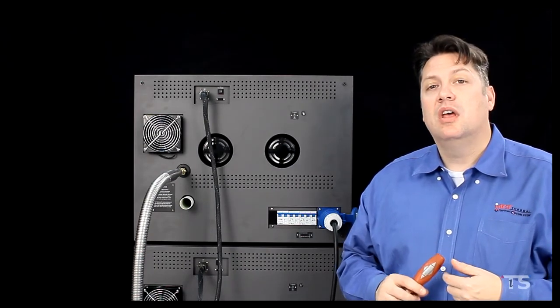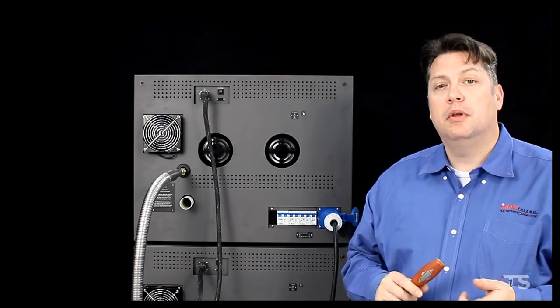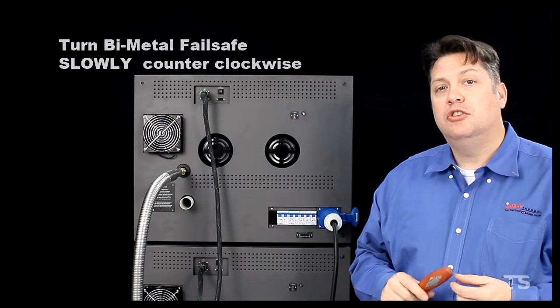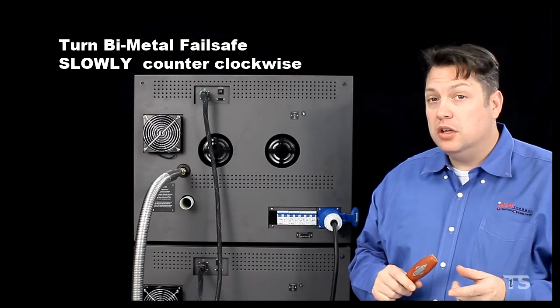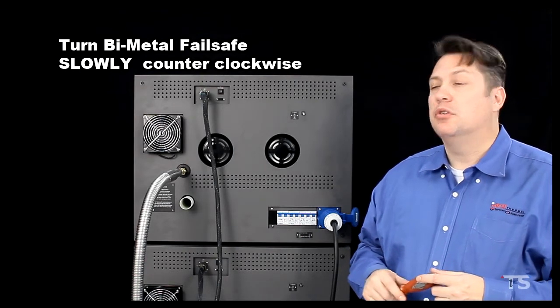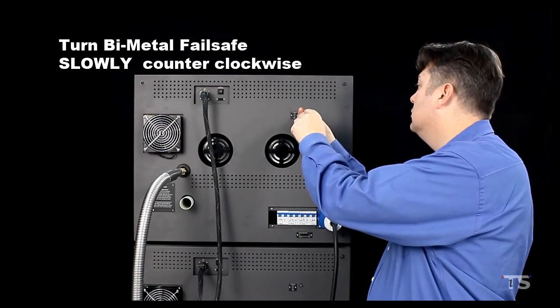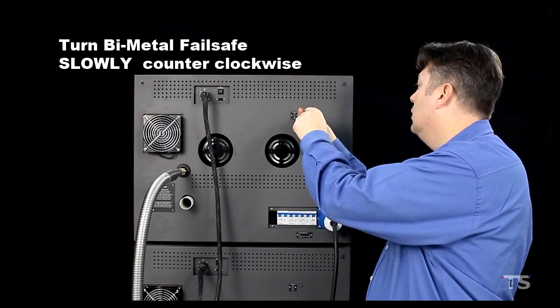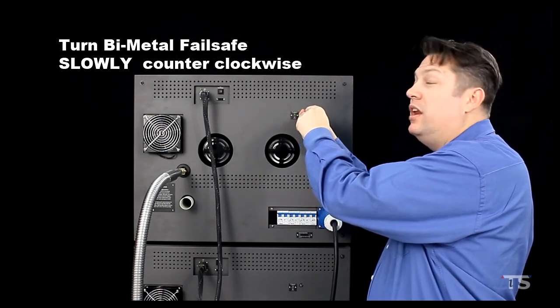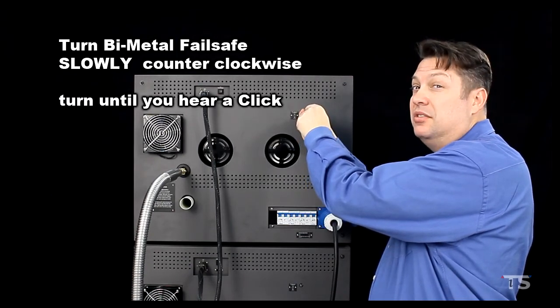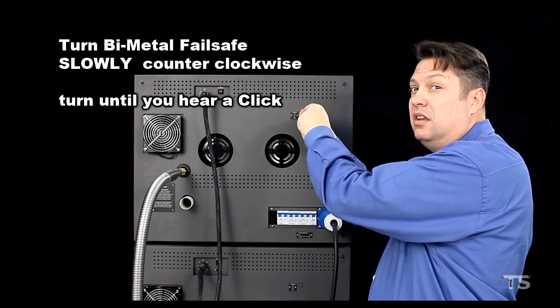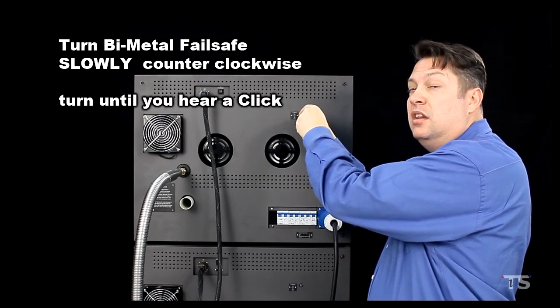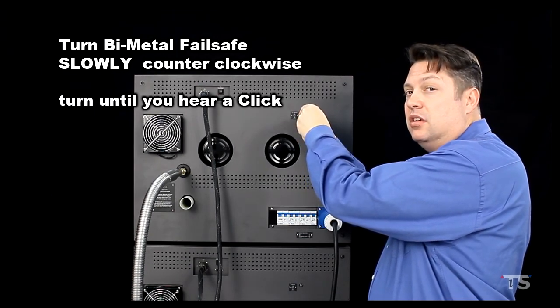Next, I will take the bimetal switch and turn it slowly counter-clockwise. I'm waiting to hear a distinctive click in the service cavity.